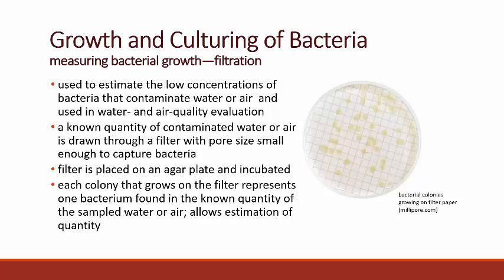So if this was a sample after filtering 300 cubic feet of air, for instance, then you would count the number of colonies there. I'm going to estimate that it's like 35 colonies. And so you would then be able to say that in 300 cubic feet of air we have 35 colonies, so per cubic foot that's however many. Okay, so you get the idea.